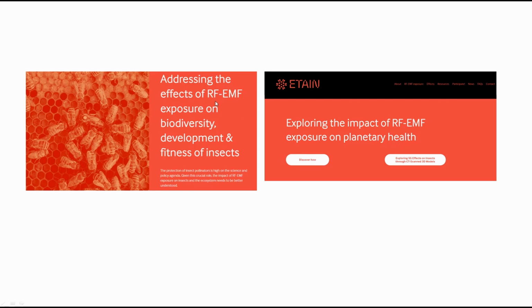They're particularly looking at the effect of RF EMF on insects, and one way they're doing it is through scanning as many different types of insects as they can using micro CT, and then doing lots of interesting things with the models thereby produced.